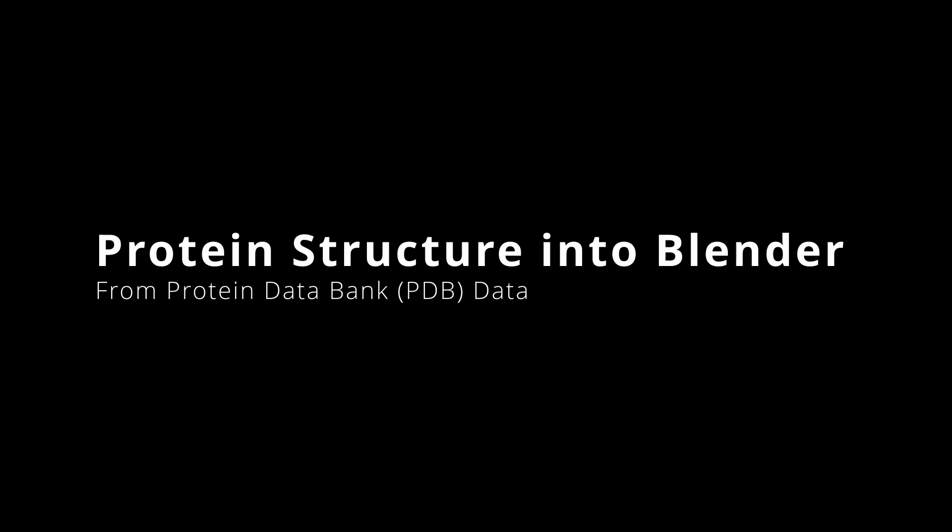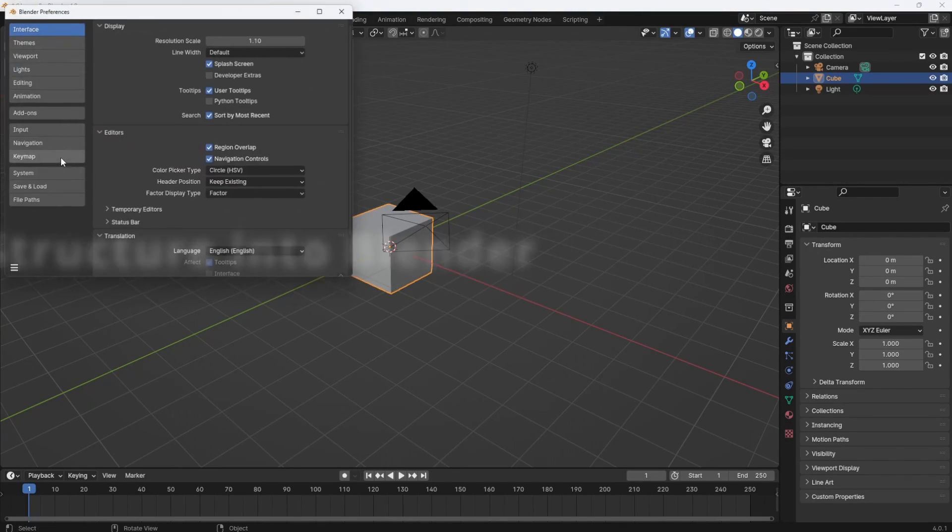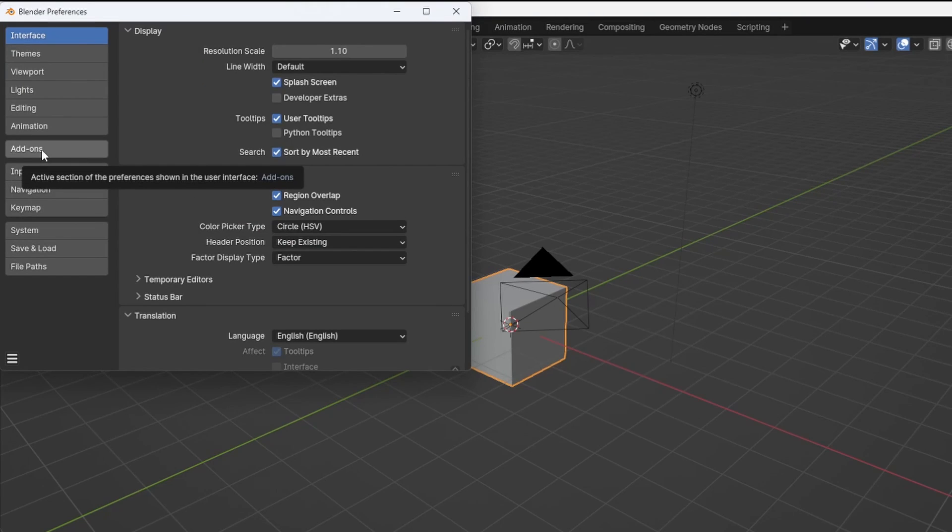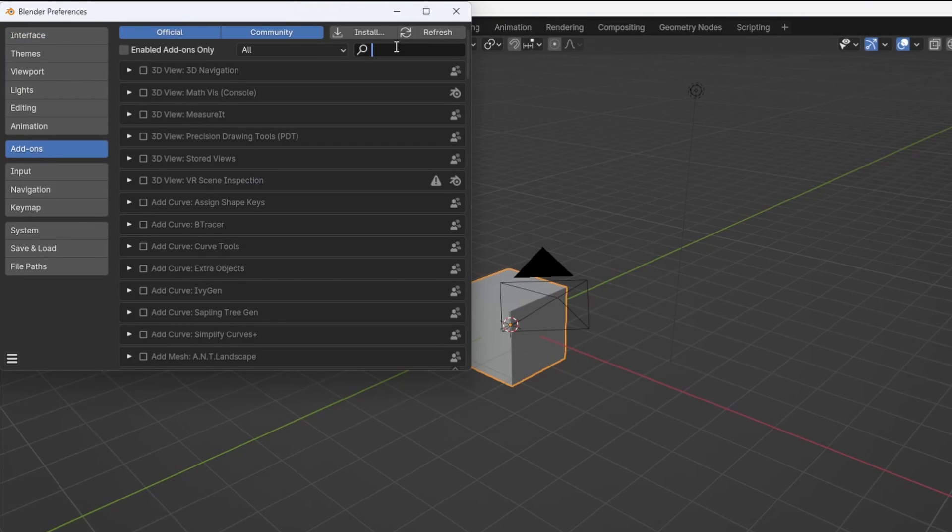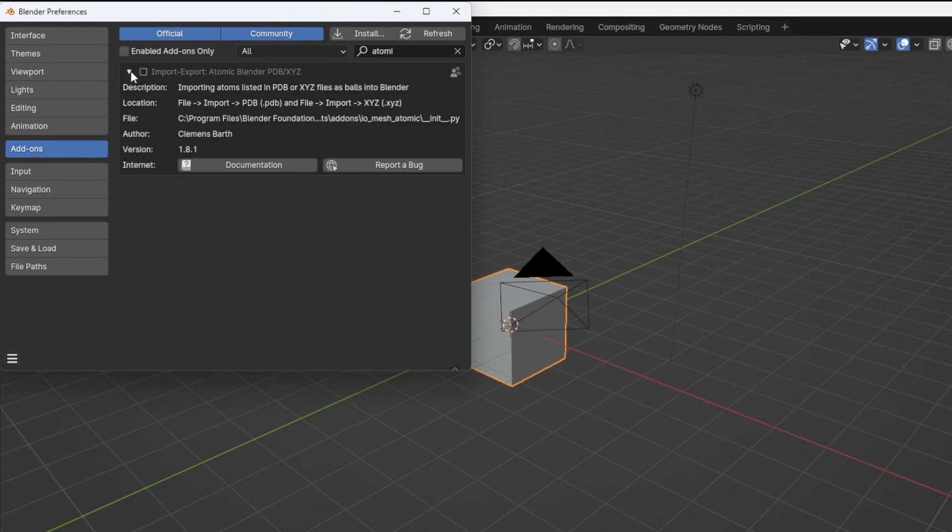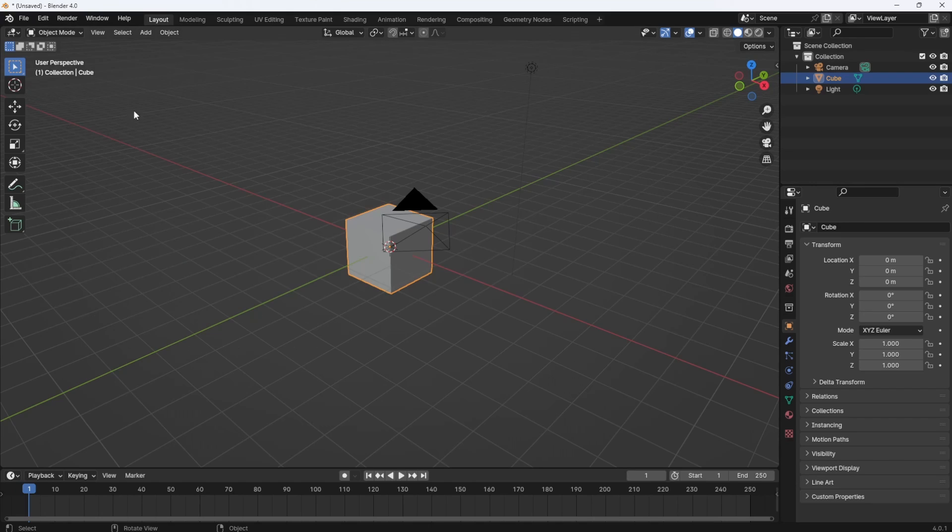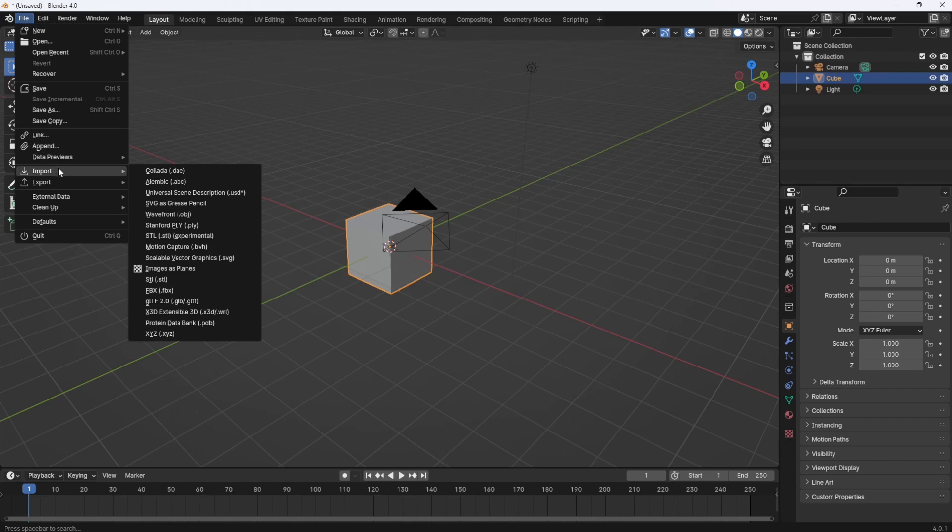Before anything else, I want you to know that there is a way to import atomic structures with default Blender only. Once you activate the Atomic Blender add-on, you can simply go and import a PDB file.